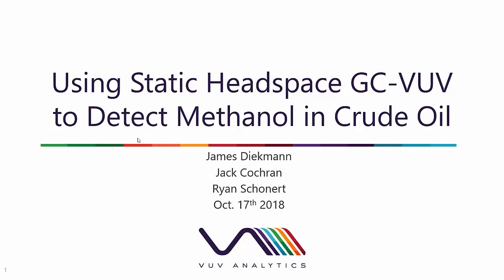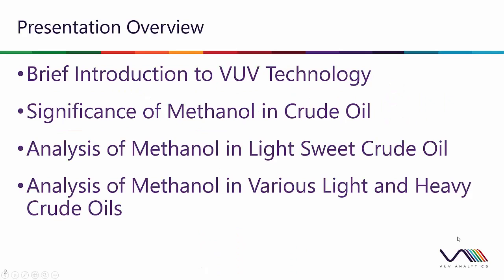So today I'm going to talk about using static headspace GC VUV to detect methanol in crude oil. As a presentation overview, I'm going to cover four main things. The first one is just to have a brief introduction to our VUV technology. Then I'm going to move into the significance of methanol in crude oil, following some preliminary analysis of methanol in light sweet crude oils, and then lastly, looking at some additional analysis of methanol in various light and heavy crude oils.